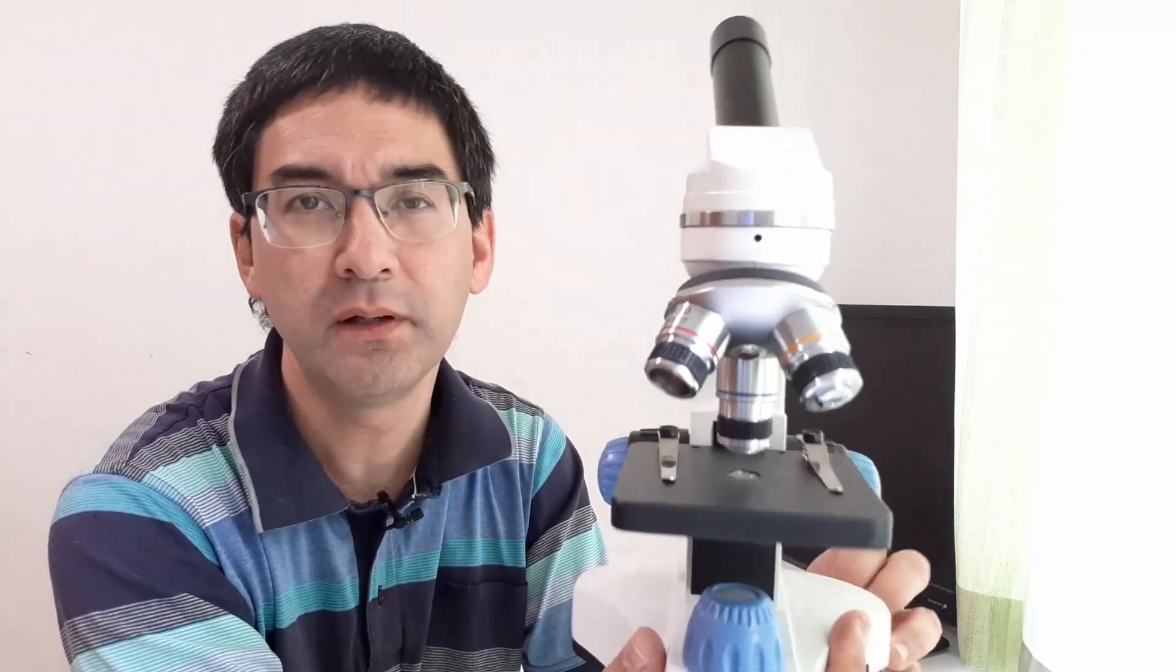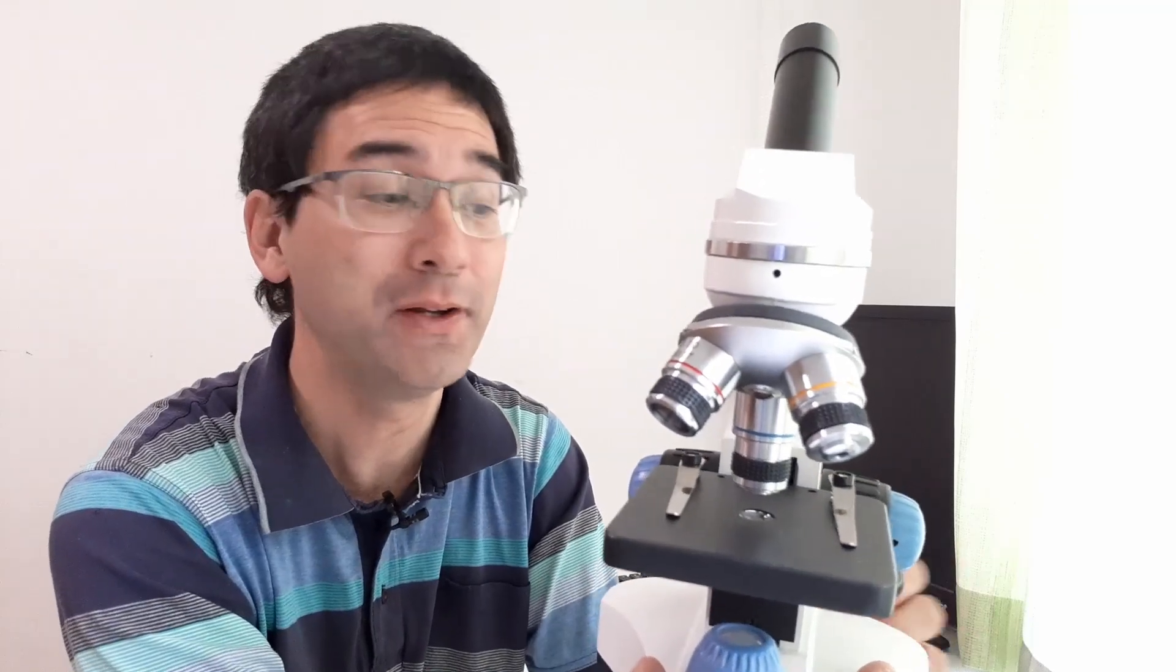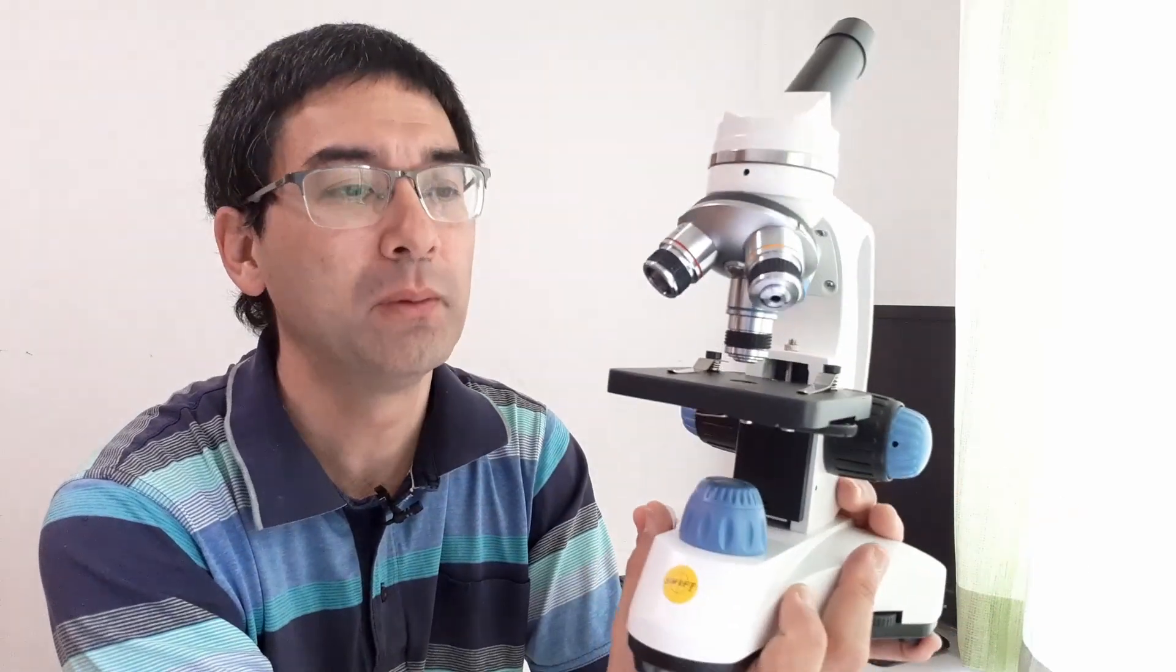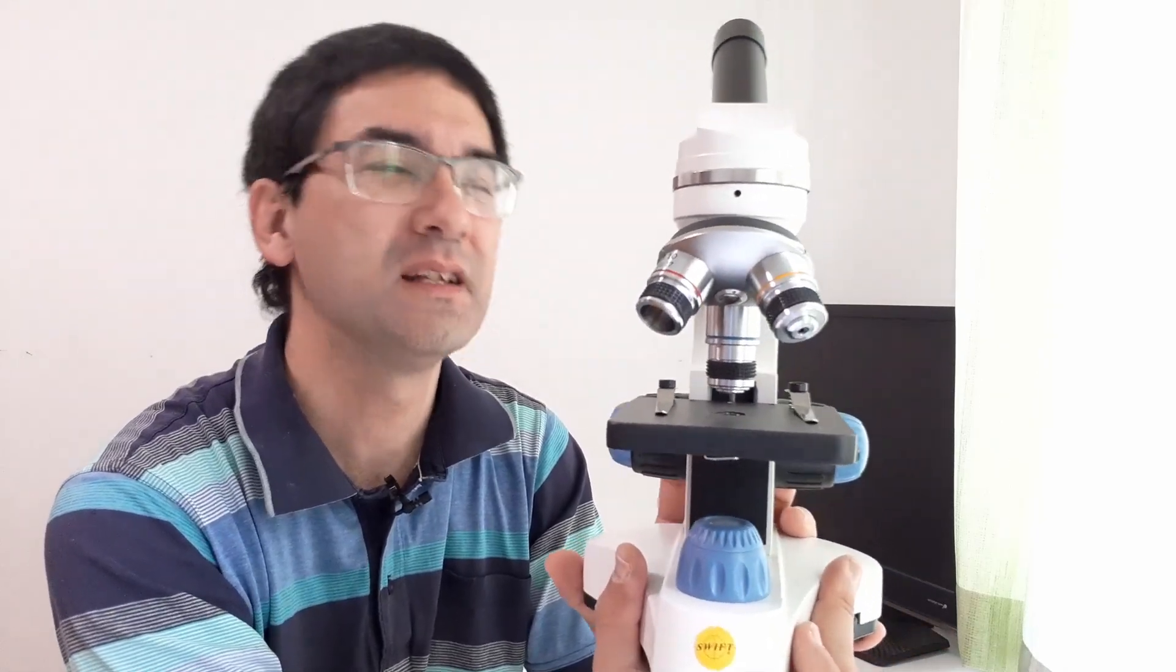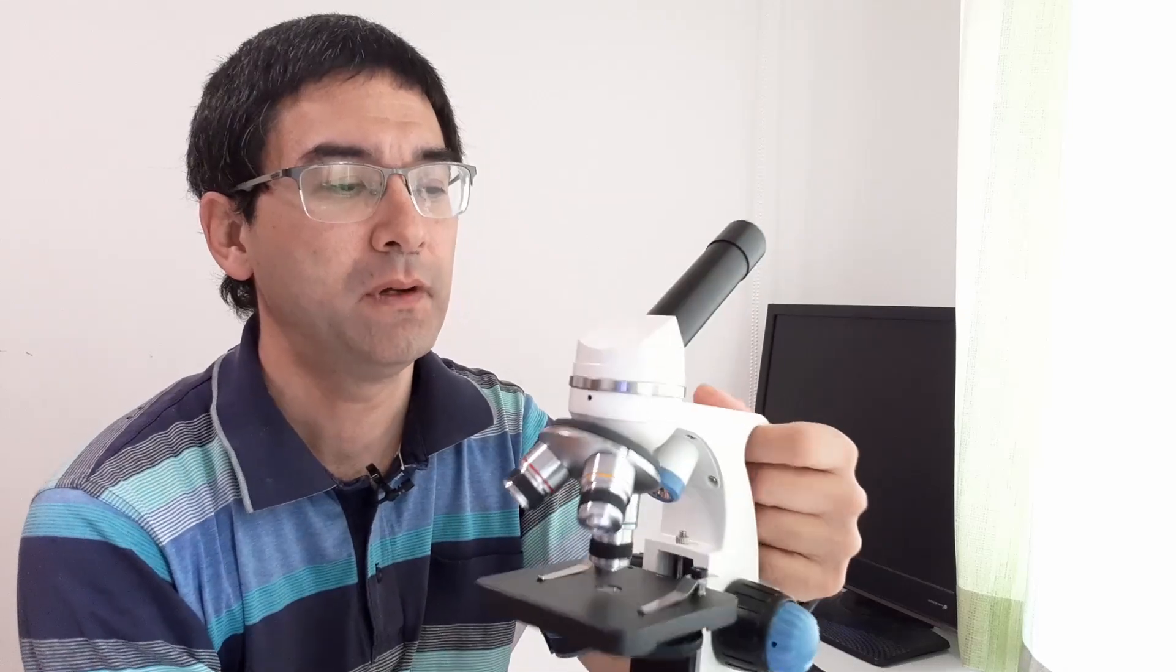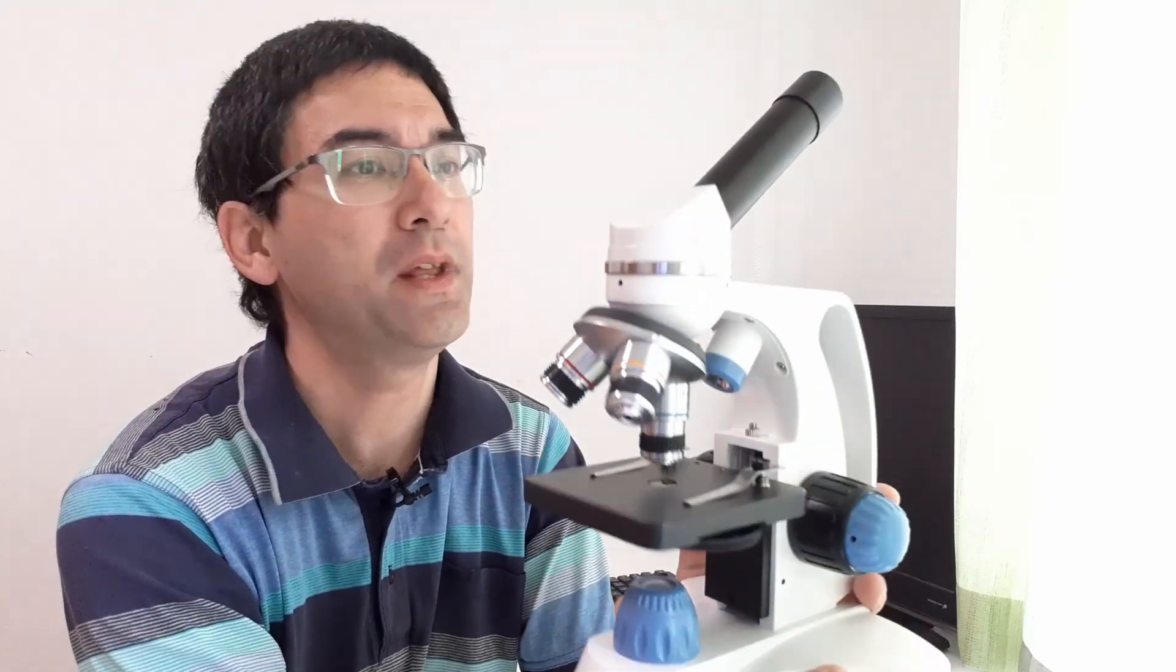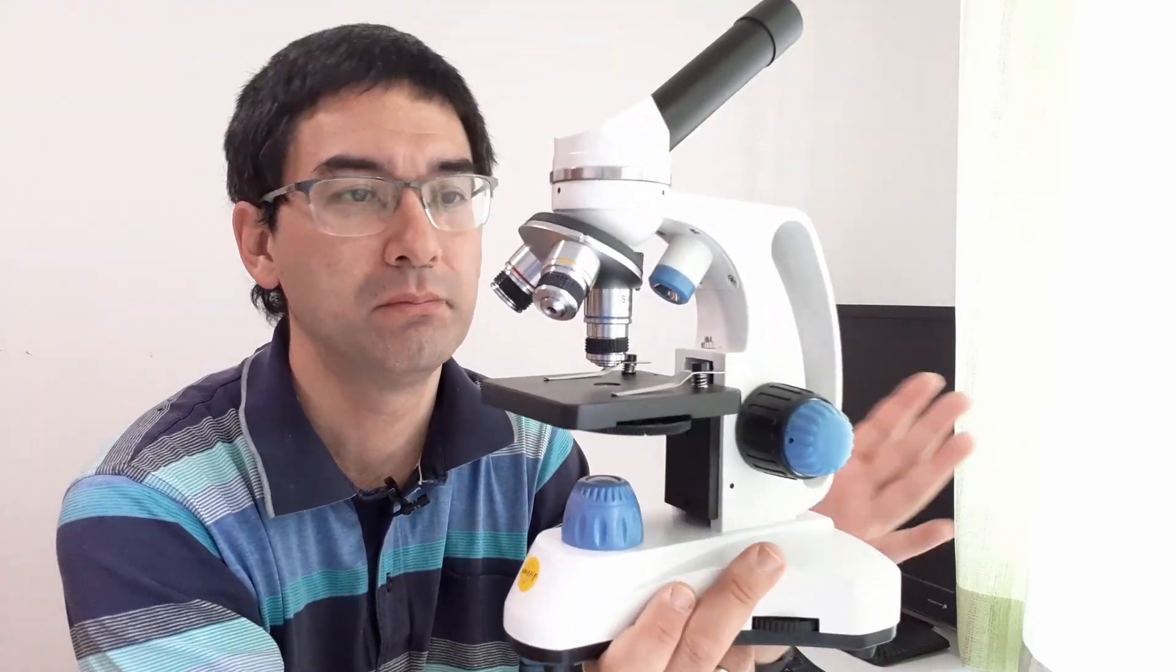Those people who are interested in microscopy much more, if you want to actually pick up amateur microscopy and if you're sure about it that you really want to go into the depths of this hobby, then I probably would suggest that you buy yourself a slightly larger model because it's a little bit small in the sense that you have to bend down a little bit on the table. If this is a problem then you just have to put it on a thick book to raise it a little bit. I've heard of several people who are using microscopes like this and they're doing serious amateur microscopy with that.